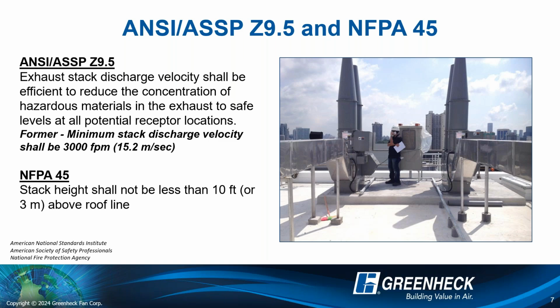Okay, you really won't see a laboratory fan under 10 feet tall. And the reason behind that is because for the people working up on the roof, we want to make sure that they are 100% safe. Okay, we want to make sure that they are not having to worry about coming in contact with whatever is being exhausted out of that space.